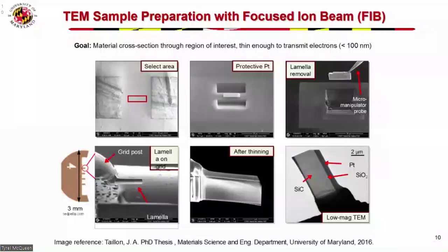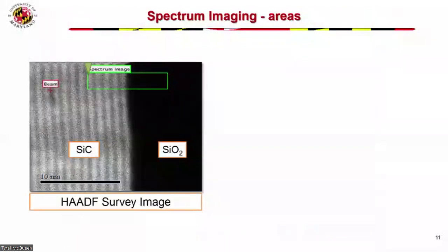So this makes very thin samples, the whole thing is pretty thin, and that way it's very good for electron energy loss spectroscopy.